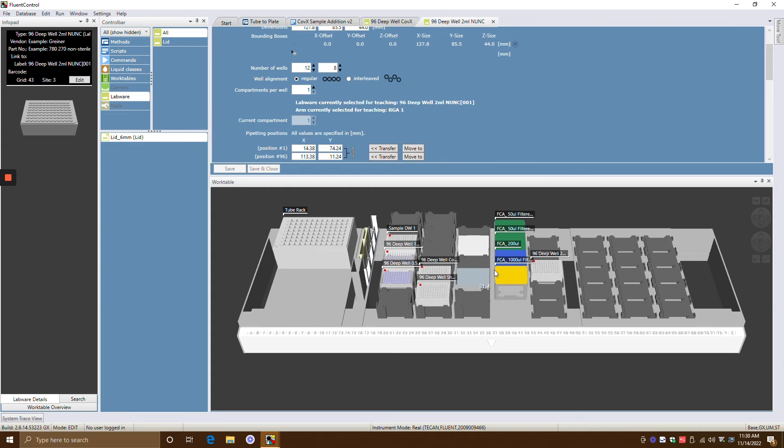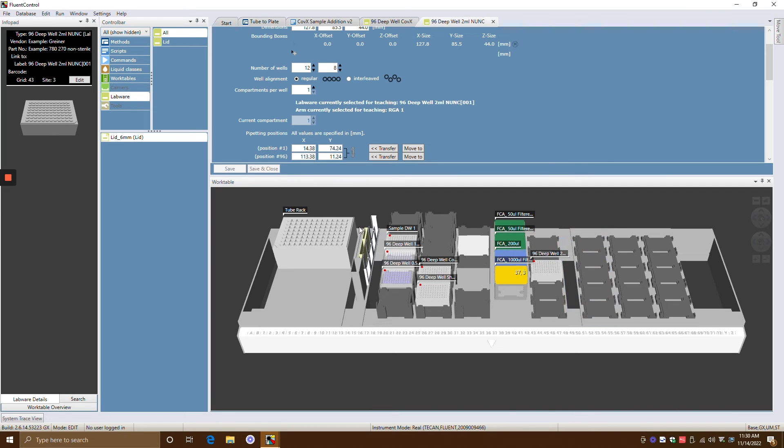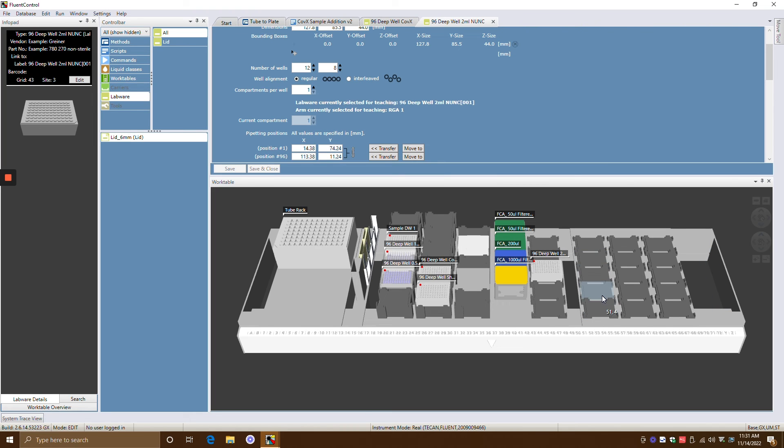So that's just kind of the general overview of work tables. Once you line up all the work tables, then when you're coding and you're programming, you just want to make sure you're referencing the right labware. And that's where you use this little labware details. And generally, you can only put the right type of labware on the right carriers. Like you couldn't put pipette tips on these nests here.